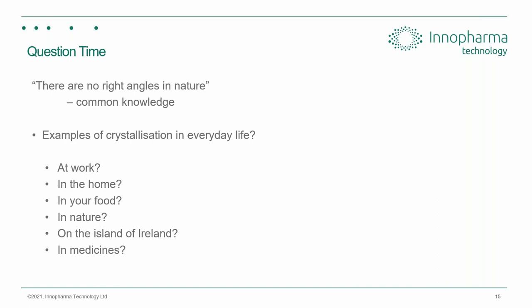Crystals are, in fact, all over what we're using. You're using a crystal right now to view this presentation. Any tablets? Interesting. Yes. Tablets, whether in medicine or in electronics. Silicon chips are an example of an extremely refined crystal. So what we're going to do is talk about the applications specific to pharma. Causeway. Yes. Sorry. There was a question mark over causeway. But yes, we'll see that example in a moment.